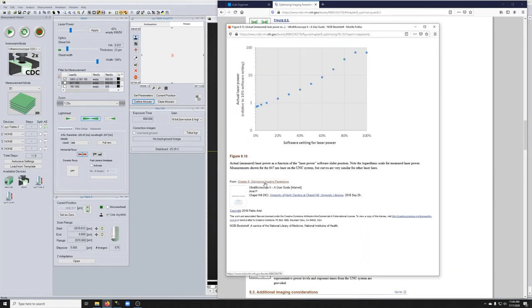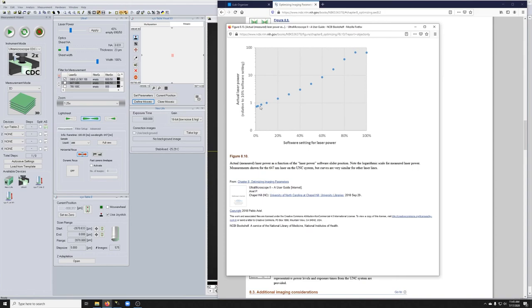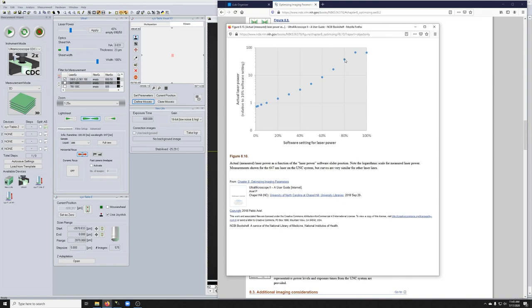This same graph is on the wall of this room. What this graph shows you is the software setting for laser power, and then the actual laser power relative to 10%, which I just made arbitrarily one, and I did that because that's the default for the software. The actual laser power relative to 10 that's measured at the sample. You can see that when we're at 80% laser power as terms of settings, that is actually maybe 50 times brighter than when we're at 10% laser power. Because this is a non-linear scale.